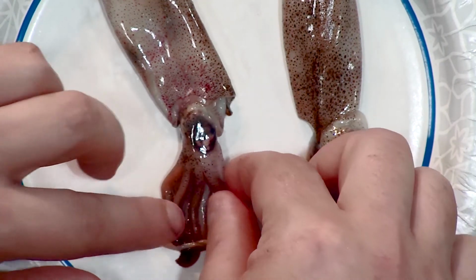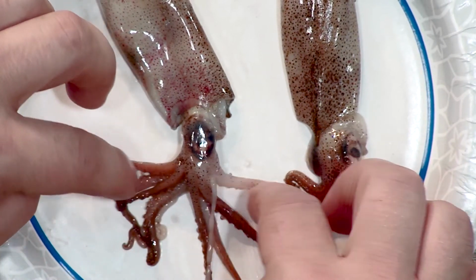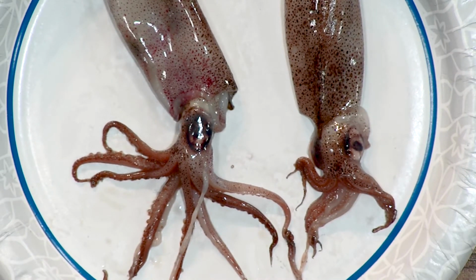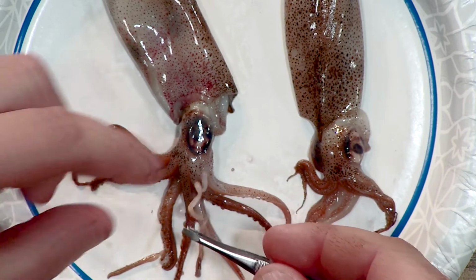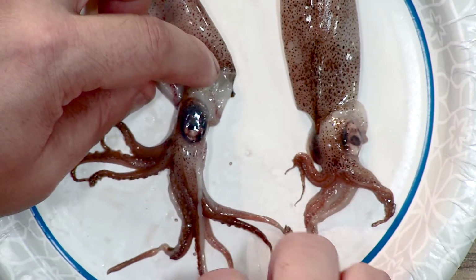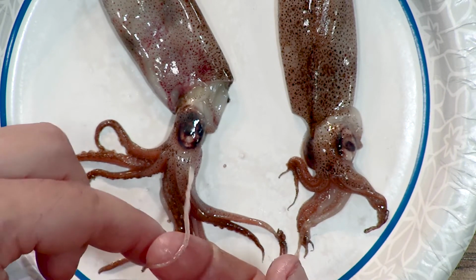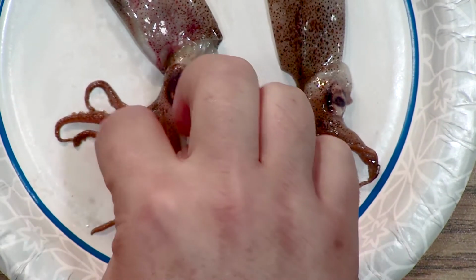And I'm going to spread out the tentacles here. Now, something that is unique about squid compared to the octopus is squid have the 8 tentacles, just like the octopus, that have the suction cups on the arms, but they also have these 2 other tentacles that are significantly longer than the other 8. These longer tentacles don't have suction cups on them until you get down to the very, very end. Pretty interesting.